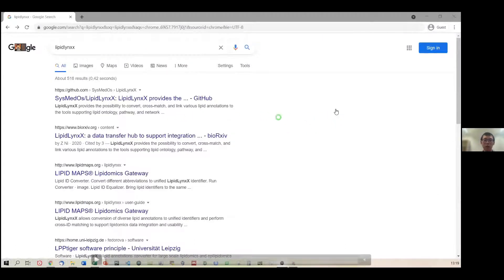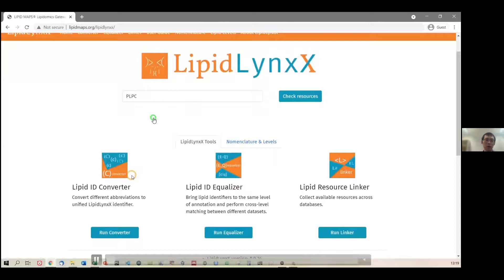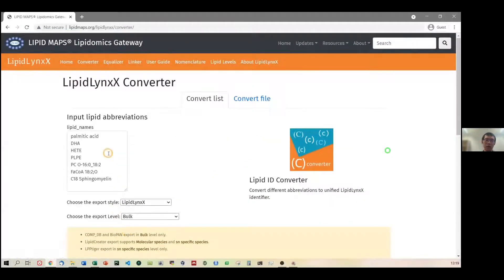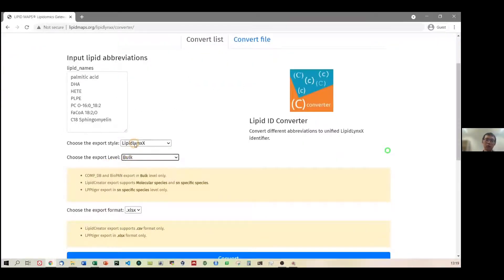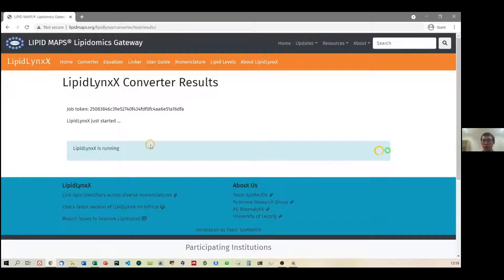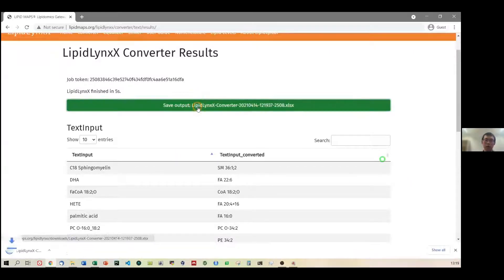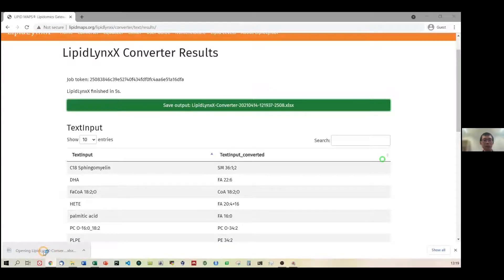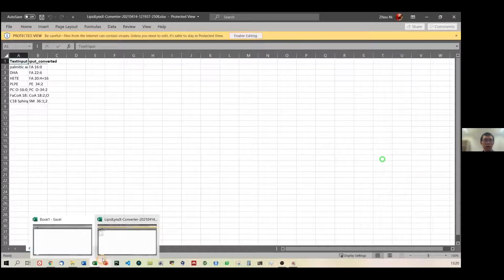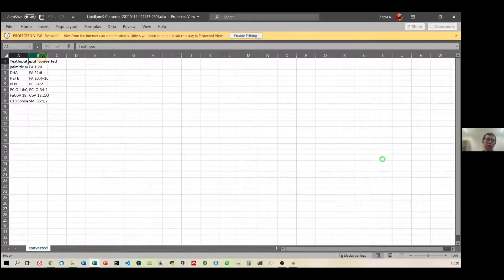Here is a recorded video tutorial. When you click on the link, it starts on the LipidMaps website with three major modules described. You click on the Converter, and there are templates available — you can select which level you want and the different output. We select shorthand notation and start to convert. After a short wait, the conversion finishes and you can review it on the website, then download the results as an Excel file with the original name and the converted name.